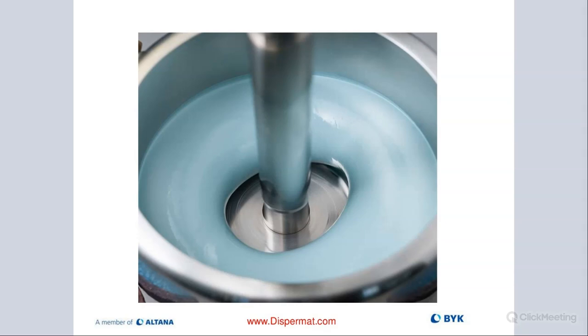If the viscosity is too high, then it's also more difficult to get a donut because you're dealing with more of a pasty slurry in some instances, so the donut wouldn't really be there either. So if you optimize the viscosity, the tip speed, and the geometric consideration, meaning blade diameter to the vessel ratio, then you should really see the donut.